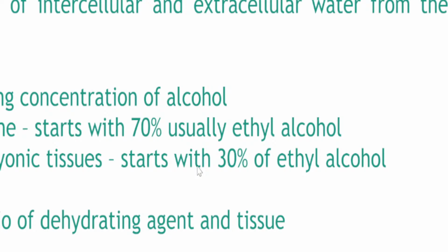But for embryonic tissue, specifically if you're going to present something in a museum curation, you're going to start at 30%. So let's focus on what's going to be asked from us by board examiners. Routine starts at 70%, increasing concentration. So ano na susunod? 80%, 90%, 100. Ganon. Okay? So increasing siya, class.